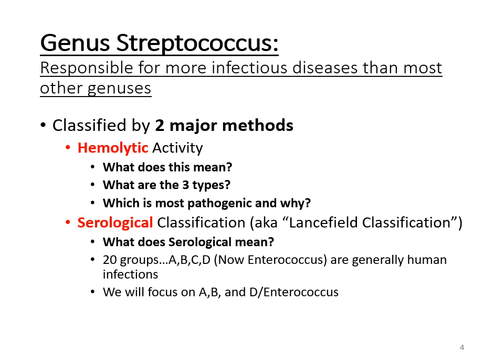And I know I say only the partial breakdown as if it's not that bad, when it's still a problem. You don't want any breakdown of your red blood cells, but it's not as bad as the complete breakdown. The third one is then gamma, and gamma means little to no breakdown of the red blood cells. So that one's not very pathogenic. So you'd like your microbes to be gamma hemolytic so that they're not causing you much harm.